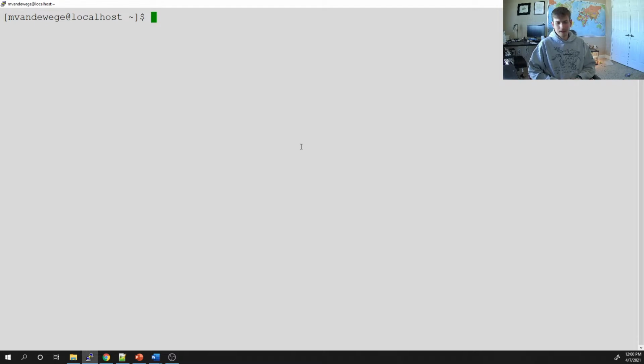All right, let's continue with annotating our assemblies. Basically, exploring our blast hits a little bit more, and basically attaching our blast hits to our FASTA file. So let's go take a look around.